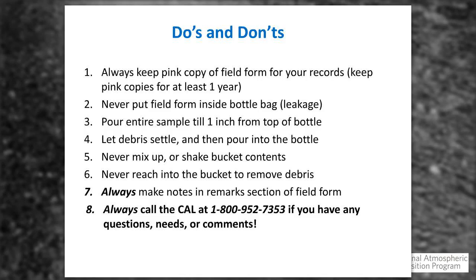Note too, when we're sending you back supplies, or sending you back the new box of buckets and you've requested supplies, always check the inside of that box. We put memos in there. We put supplies in there. So if you're asking for something, that's a good place to check. And if you ever have any questions, comments, or ever need anything, use the 800 number, 1-800-952-7353. Get to hear my friendly voice. I'll try to get back with you as soon as possible via either a phone call or email. If it's something I can't answer right away, then I have plenty of people around me that help me in reference to things I'm not necessarily educated about, but we are here for your disposal.